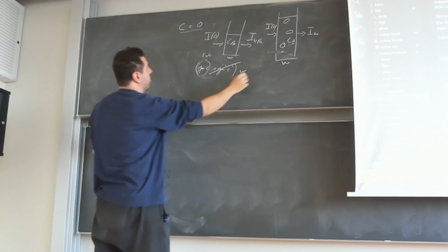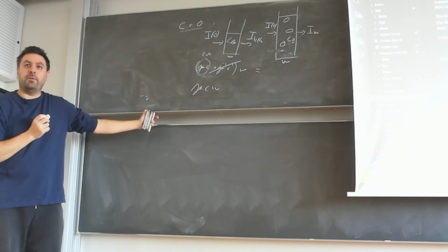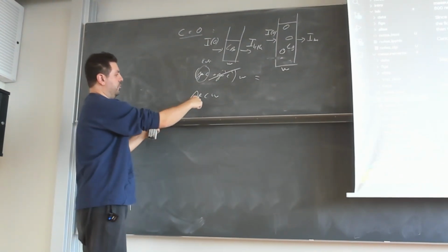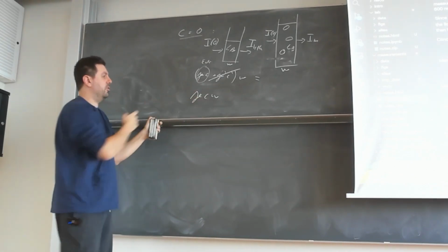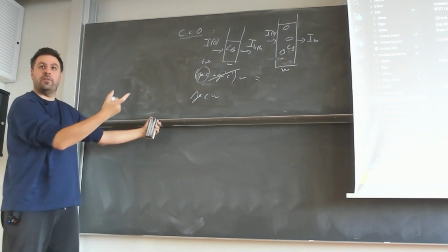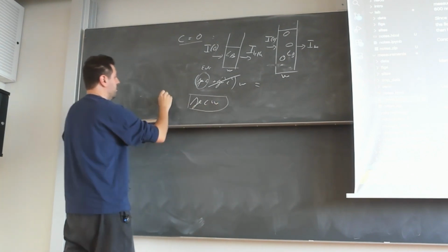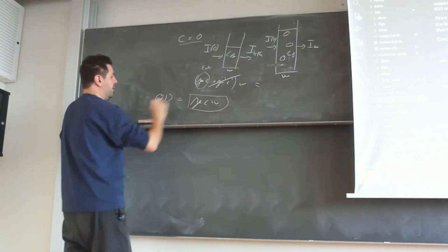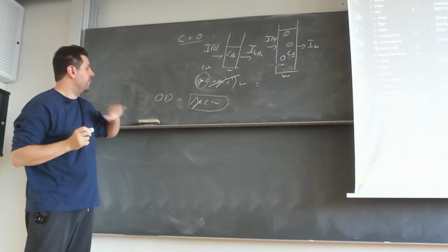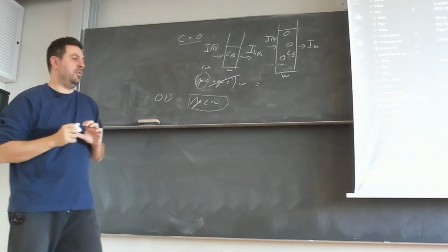Right? So what I will get here is actually gamma CW. So I will get a measurement, called the optical density measurement, that is proportional to some gamma, which we don't know, proportional to some concentration, which is actually what we're interested in, and proportional also to the width of the sample. Yeah? And the optical density after blanking will be this. I'm chickening out a little bit here because we took the logarithm to the base e, and normally we report it to the base 10, but you get the principle here, right?